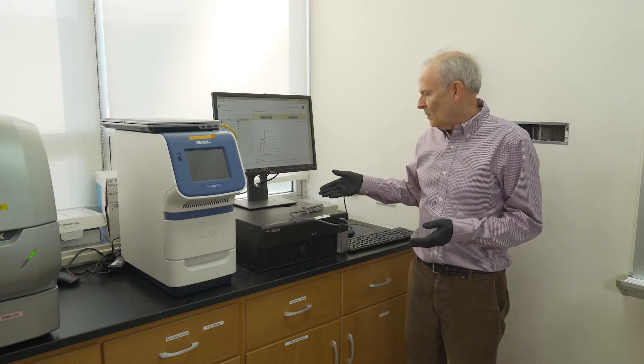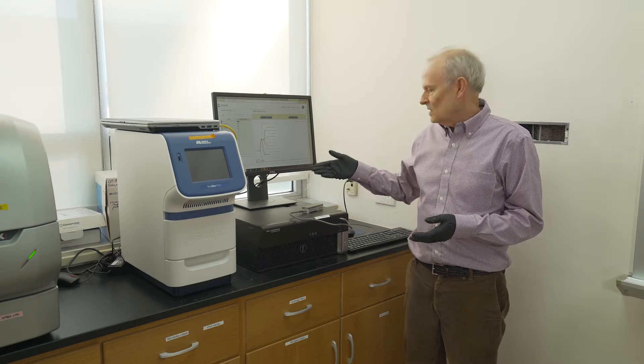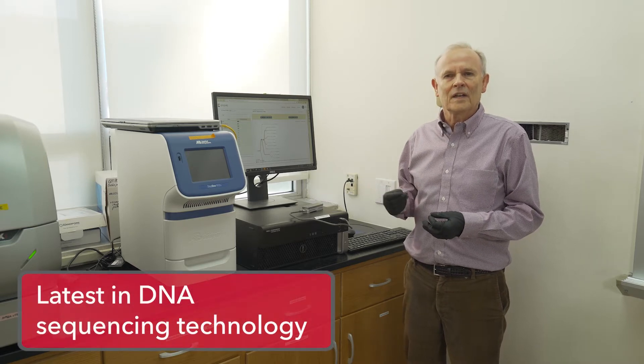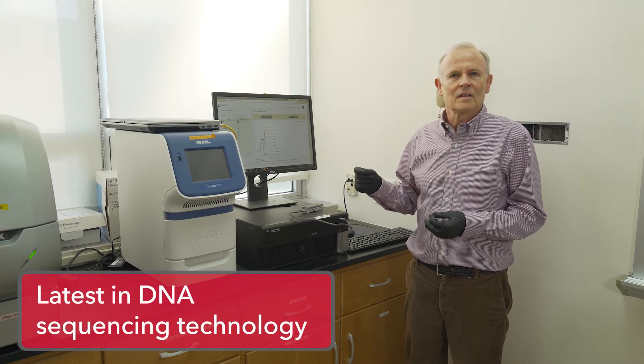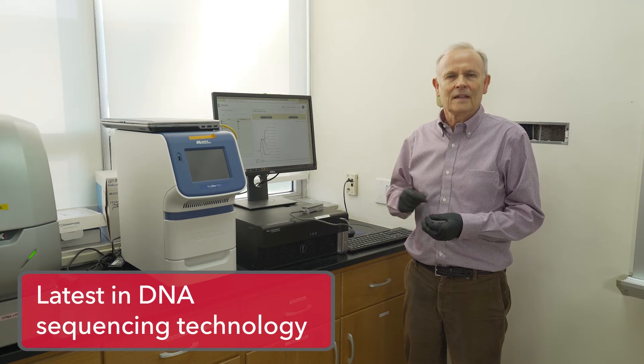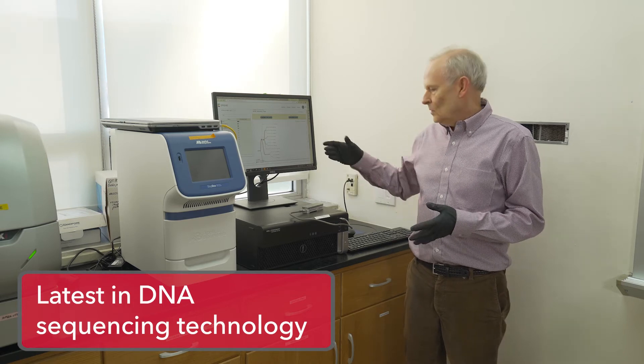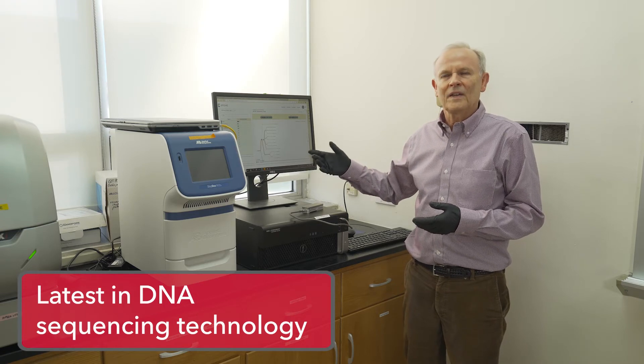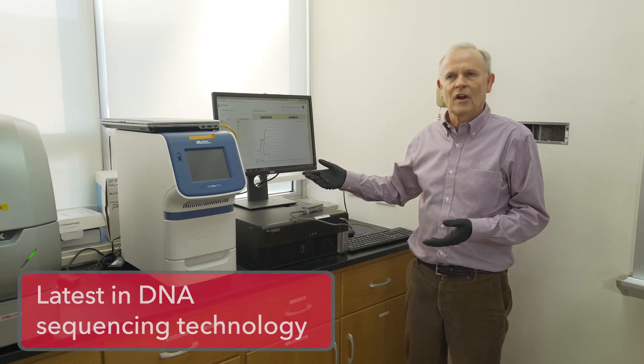Another thing we can do with the DNA we've amplified is sequence it. In this lab we have a MinION sequencer — this is a third-generation sequencer — and we're able to detect each of the bases of the DNA in sequence, then take that data and BLAST it to the NCBI database where we can identify what gene it's from.